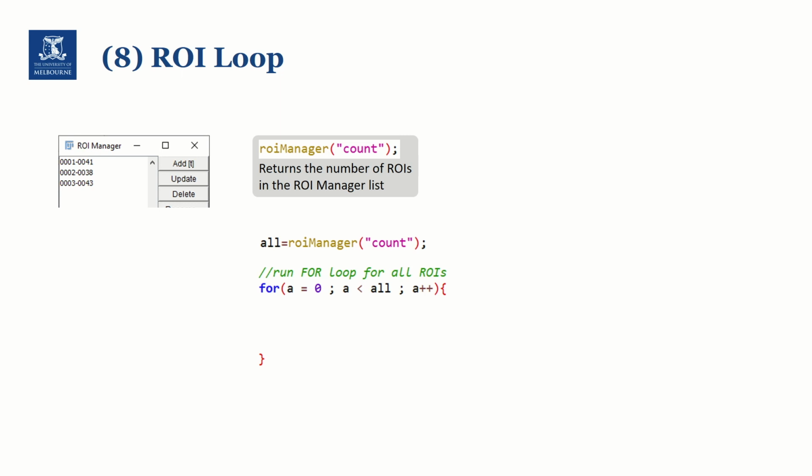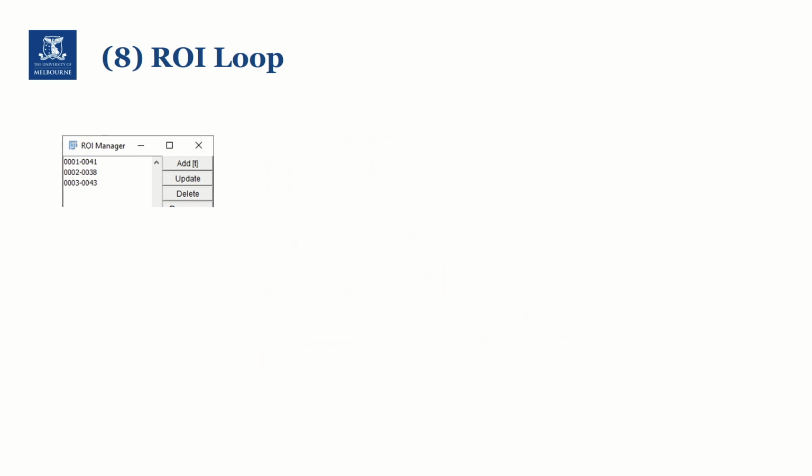And inside the for loop, we will check if each ROI is positive for green or red or both markers using the red and green masks we have generated previously. So how can we check the positivity? Well, the ROI list is essentially a list of selections.